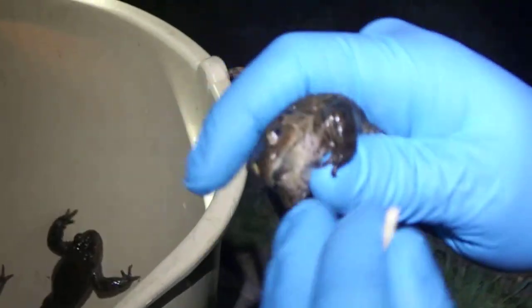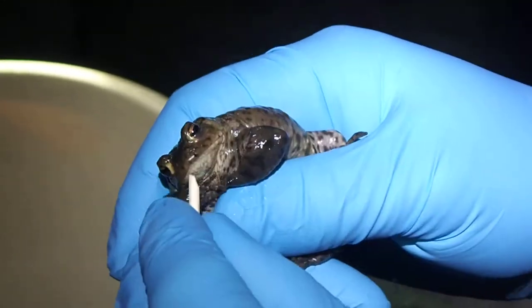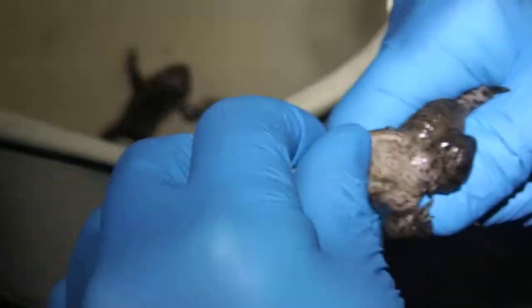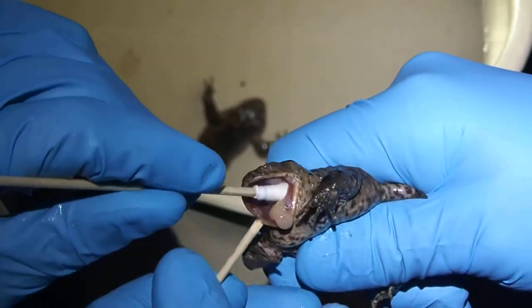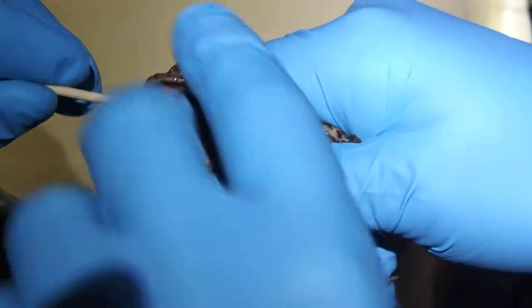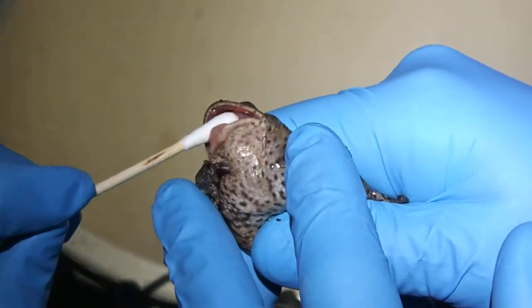Then firmly hold the toad, and you can either open the mouth by putting this at the front or at the side. If you open the mouth like that, then you can stick the swab inside the mouth and rotate it for about ten seconds all around the mouth.